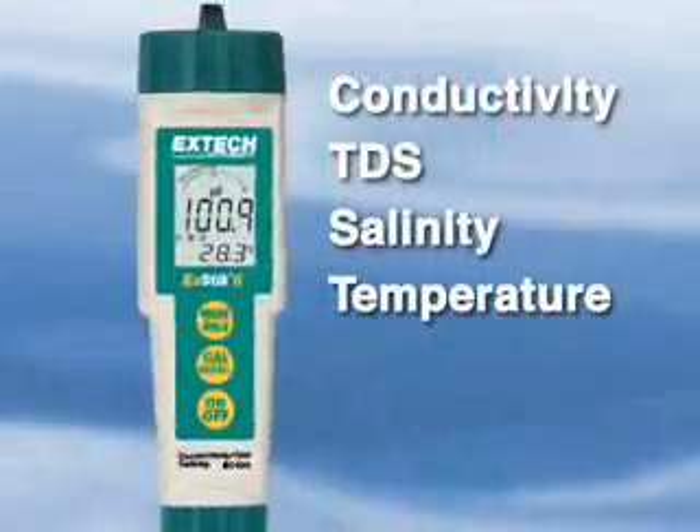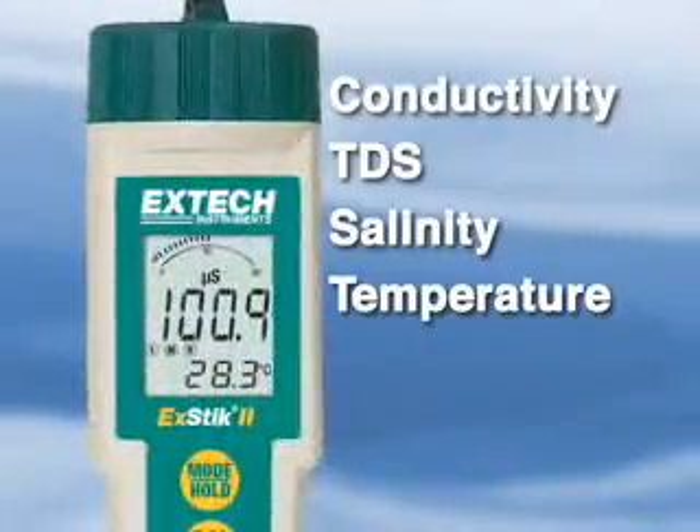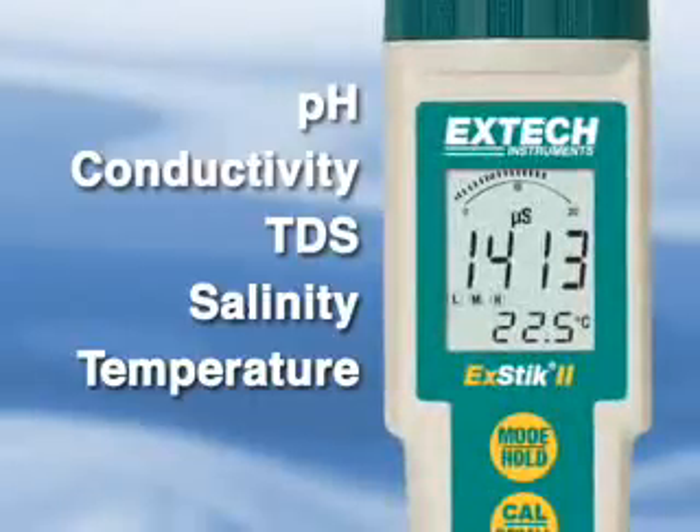The model EC400 is a 4-in-1 meter measuring conductivity, TDS, salinity, and temperature, while the model EC500 is also capable of measuring pH, making it a 5-in-1 meter.